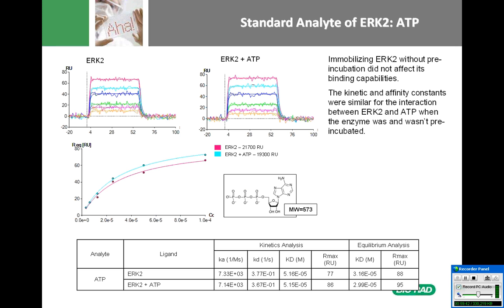For the ERK2, there was actually no need for the pre-incubation because it was active even if it was not pre-incubated with ATP, and the kinetic constants are very similar, with pre-incubation and without pre-incubation, meaning that the binding site is not blocked upon the immobilization procedure.